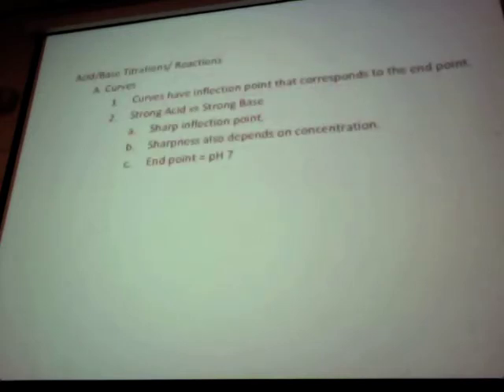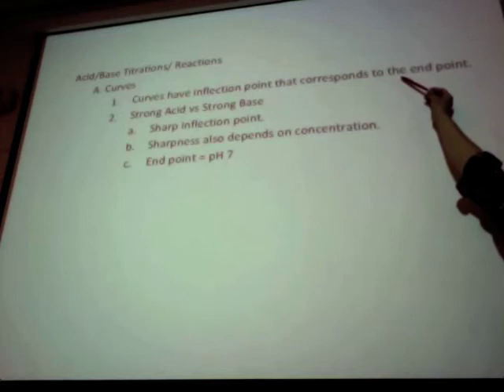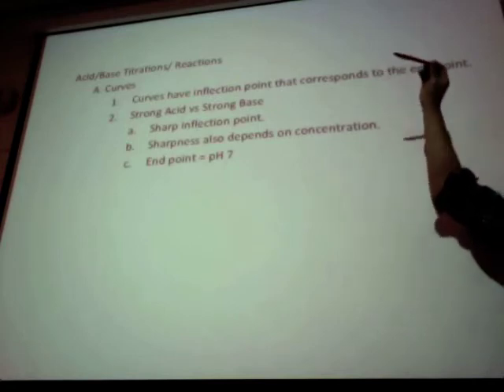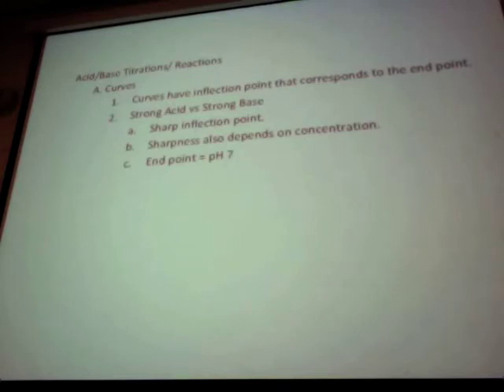For acid and base titration, if we monitor the pH, then we can see the curve. Otherwise, we only see the color change, colorless to pink. If you monitor the titration curve, then the curve will have an inflection point. You add hydroxide to acid. Here is the pH.